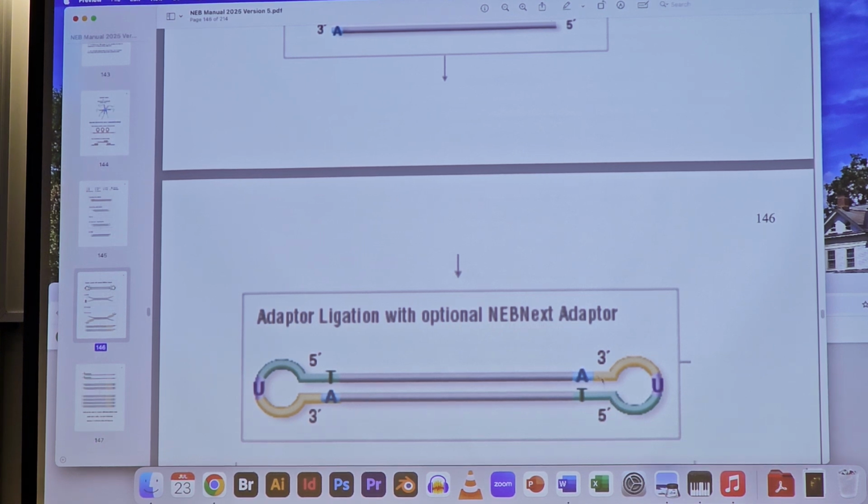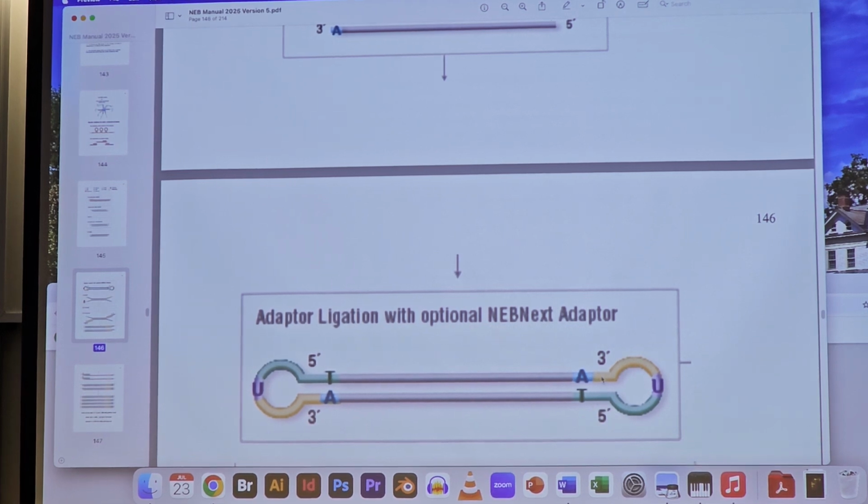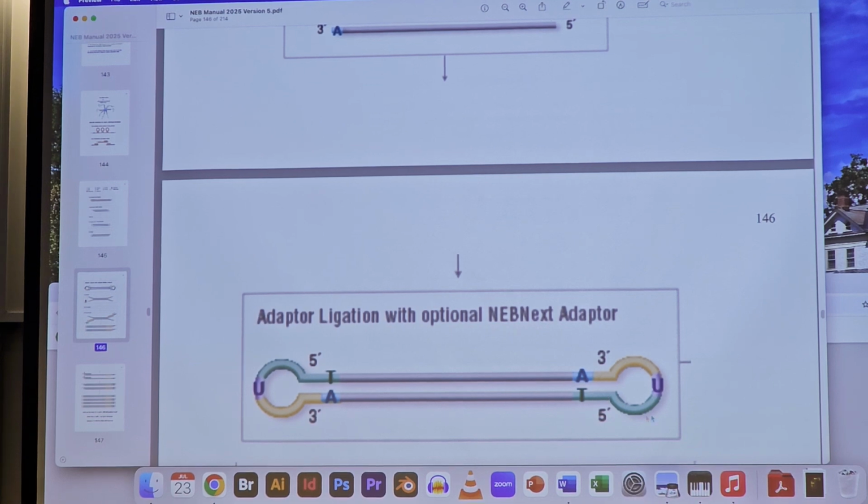Yes. That's the 5' end of the adapter is homologous to the 3' end of the adapter. So they will actually hybridize like this and form the stem loop. And when it ligates on, it's already in this stem loop configuration. So the T will ligate here, and the 3' end is already in the correct position to ligate here. So it's a base pairing or ligation or both? No, this is base pairing here. The stem is formed by base pairing within the single-stranded adapter.